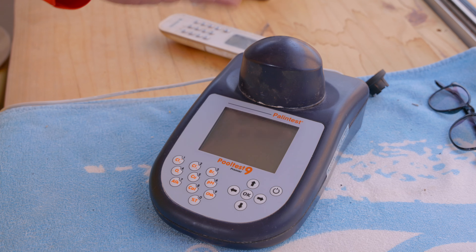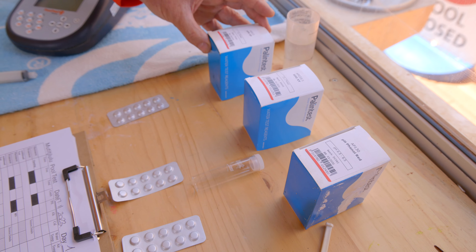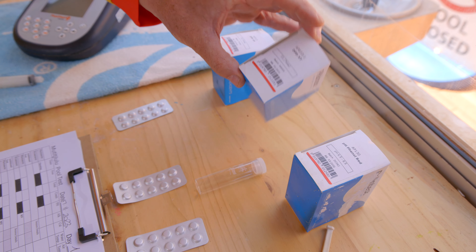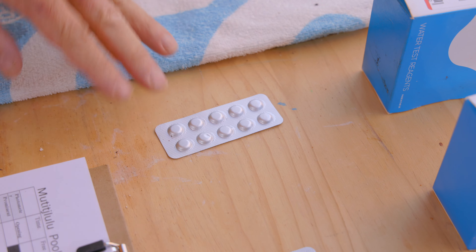Today we're going to be doing the three essential water tests that need to be done prior to the opening of the swimming pool and that need to be done every three hours thereafter. The tests we're going to be doing today are our free chlorine and our total chlorine, and then we take those two figures to work out our combined chlorine. The other test we'll be doing is our pH level.